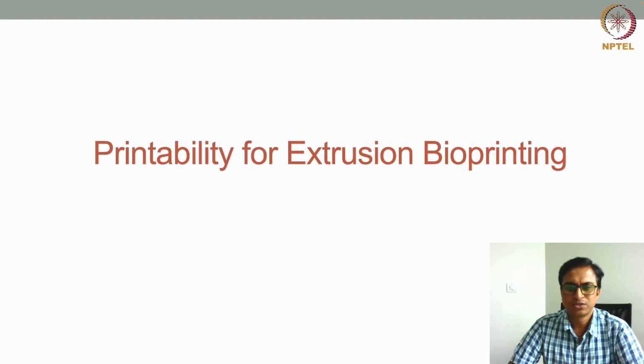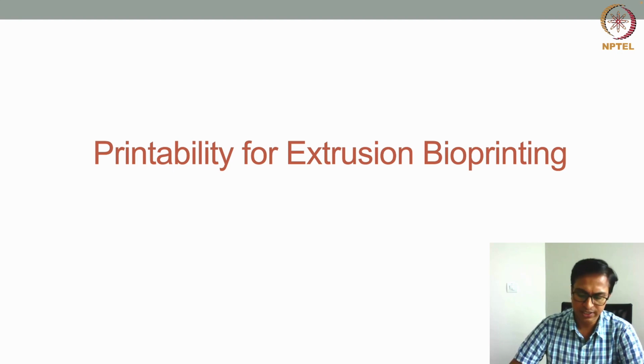Dear students, welcome to the organ printing course. In this lecture, we'll discuss printability. Basically, we'll define printability for extrusion-based bioprinting systems and what are the different parameters that dictate or decide the printability for an extrusion-based bioprinting setup. We'll discuss all these things here.